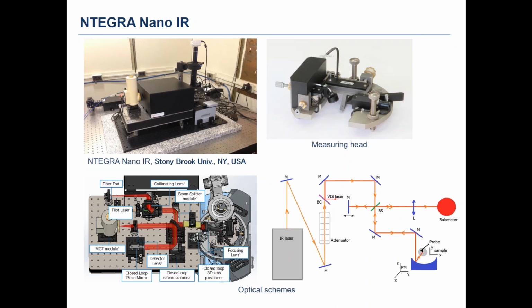Okay, so some AFM related questions. What is the noise level of your AFM part, the AFM head? The AFM head itself, the optical beam detection scheme, has a noise level of about 25 femtometers per square root hertz. Once the cantilever is in contact with the sample, we have a noise level of about 0.3 angstroms in the 10 to 1000 hertz frequency range.